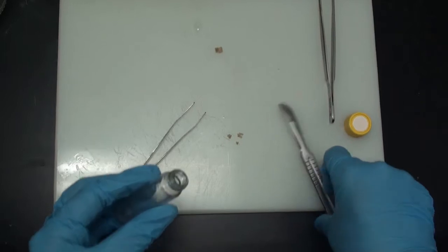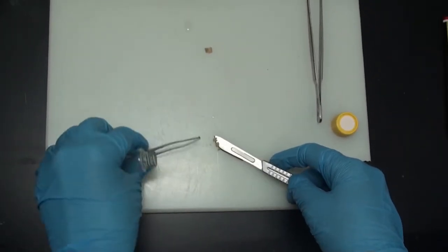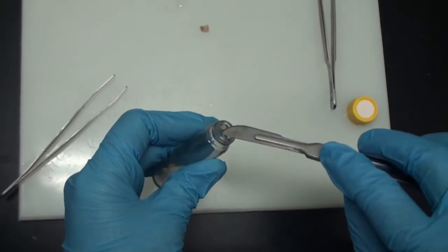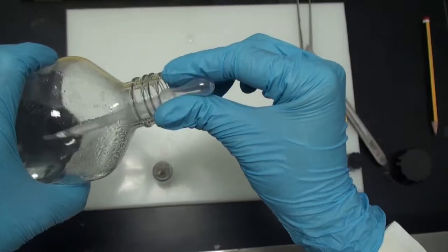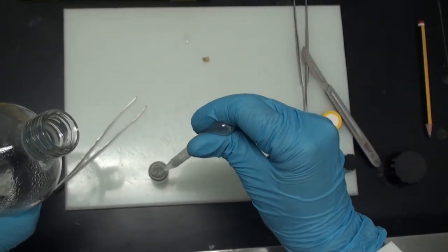We will place the sample in the fixative glutaraldehyde and leave it for two days. Remember that glutaraldehyde is a more powerful fixative material, which is why we use it with the electron microscope.